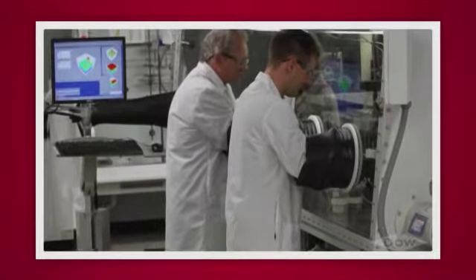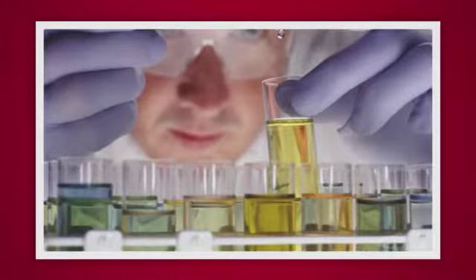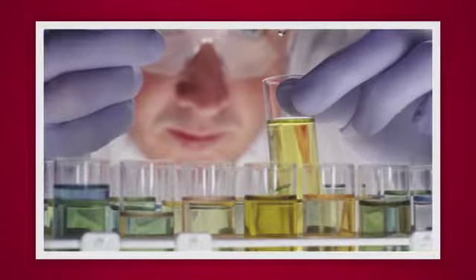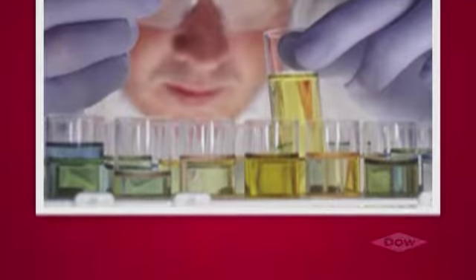Ask your coworkers to do a procedure walkthrough with the equipment. This helps you identify and correct potential safety issues up front. And with this input, you are better able to develop a procedure that reflects how people will actually use it.